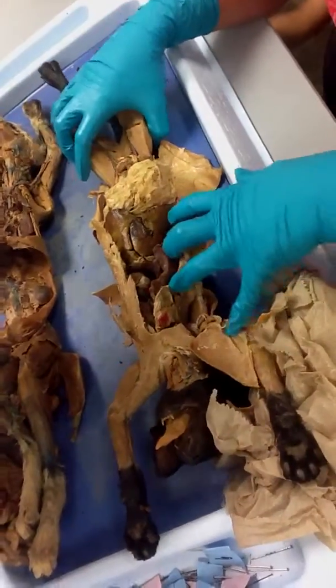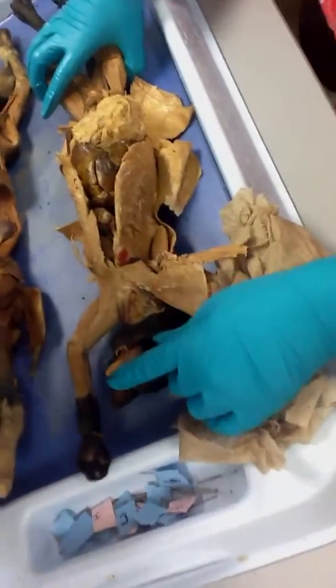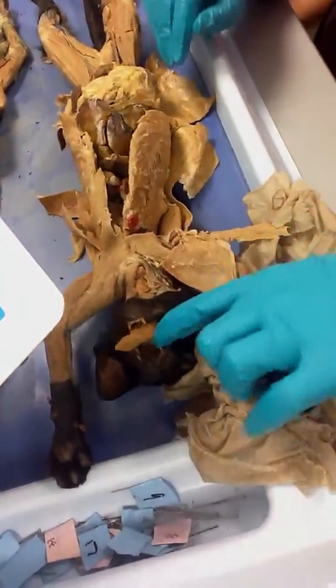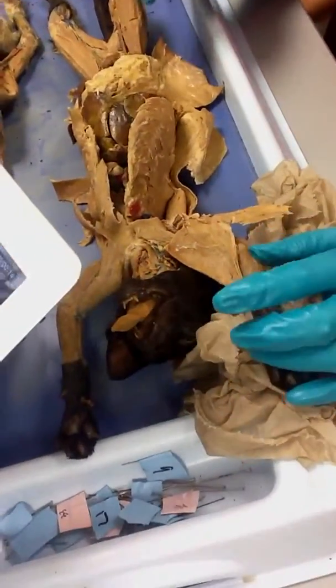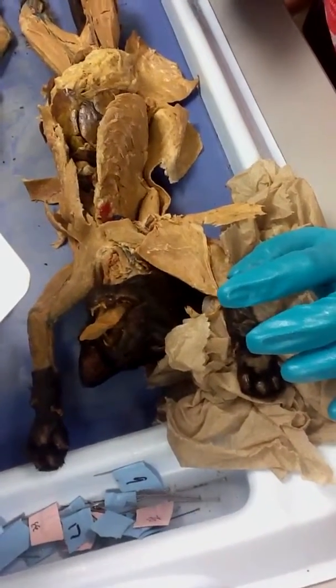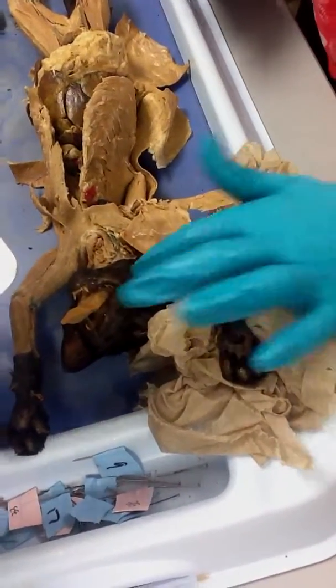Digestive system. Digestion starts in the mouth with mechanical digestion. We've got a hard palate, which is the top part of the mouth, the roof of the mouth, and then beyond that is a soft palate. You can feel the difference if you put your tongue on the roof of your mouth. You can feel the hard palate. Put it back farther, you can feel the soft palate.